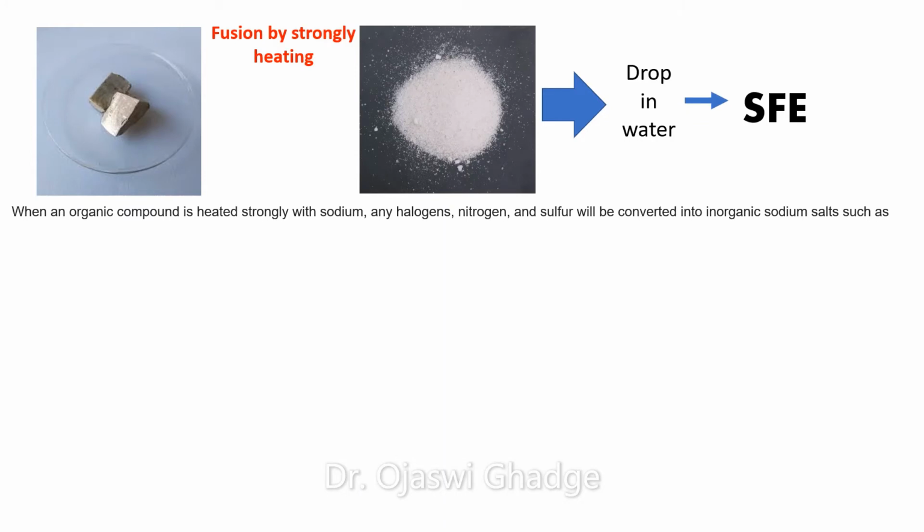Okay, so this is the picture of sodium metal, and please beware, we don't have to use this huge amount of sodium metal for the test, and there are so many precautions which we have to follow. We have to take a very small piece of sodium metal using forceps, and whenever we are handling sodium we have to wear gloves. We cannot throw these pieces of sodium into the wash basin directly because sodium is highly reactive with water.